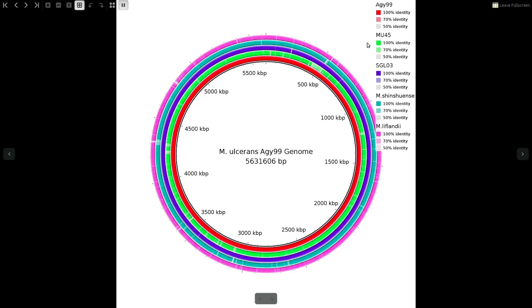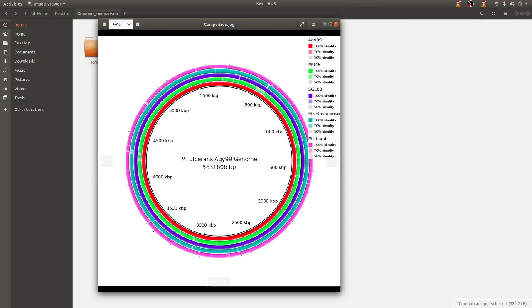Now if you look at this section here, you realize that the labels have a bit of an overlap with two of the ranks here. This is where I usually prefer to select SVG as my format, so that I can use a software called Inkscape, which is an example of software to manually edit this image so that we have it nicely placed, just like the one I showed in the PowerPoint presentation earlier on.